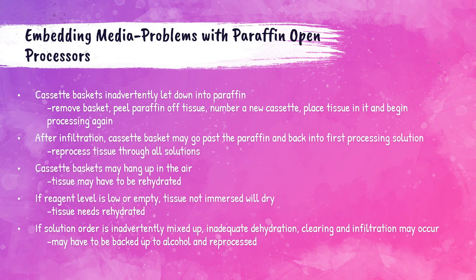Some problems can occur while processing tissues with an open processor. The cassette baskets can accidentally be placed into the paraffin instead of the starting solution. If this happens, remove the basket from the paraffin, take out each cassette, and let them cool. Once cooled, the paraffin will be solid; open each cassette and peel the paraffin off the tissue sample. After all paraffin is removed, place the tissue back in a fresh cassette and reprocess it.